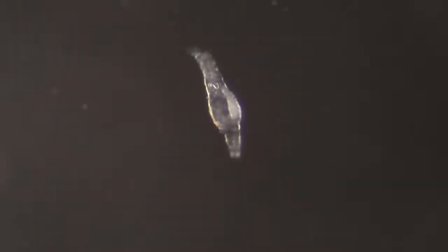Well, it was a rotifer. It's not looking too good. I think it was okay a little while ago. See, the bottom part is broken up. Just like that cell that broke up in the last stream I did. Rotifers do the same thing. You see, the bottom part is just kind of dissolved and spilling its contents out. Let's go a little closer.